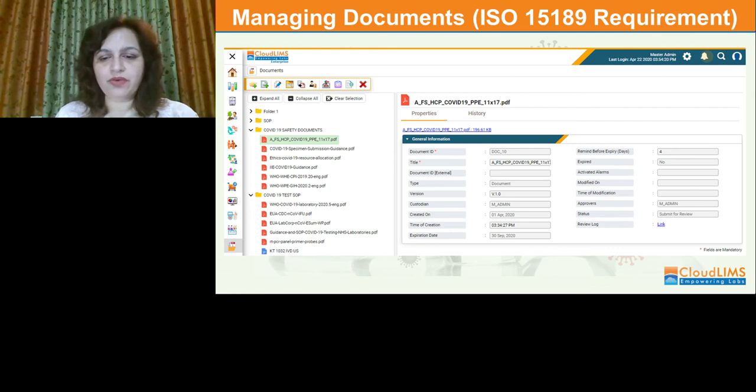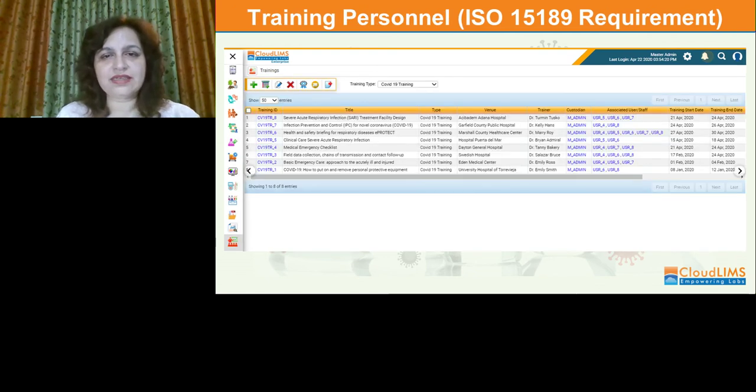One of the most important resources available to a lab manager is his staff or personnel. A LIMS helps you keep track of the staff's technical competence and helps identify training needs. A LIMS helps you manage staff records along with their education, qualification, training, technical knowledge, skills, and experience. Knowing this information, a lab manager can identify additional training requirements for handling the current situation, for example, using biosafety cabinets or handling hazardous specimens.